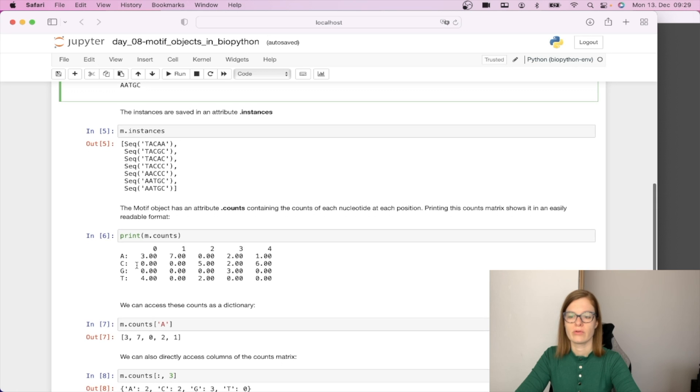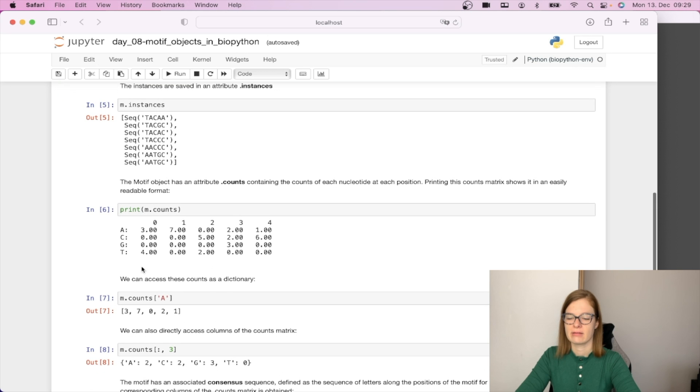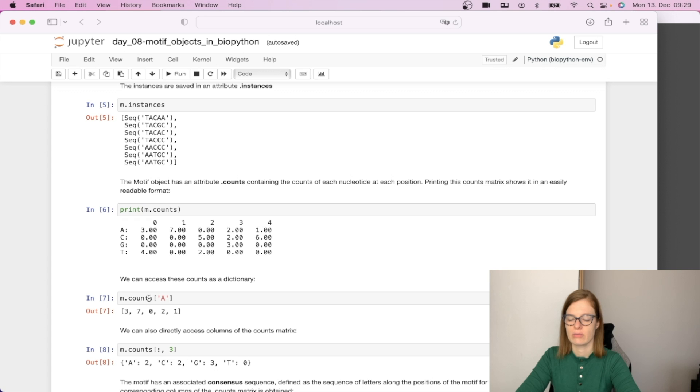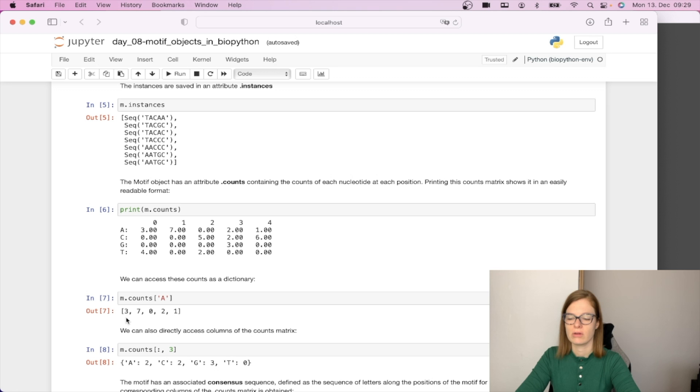Furthermore we can access these counts as a dictionary. If we would like to get all the counts per position for nucleotide A, we can call m.counts and access the A nucleotide. This will give us the list of all the counts for nucleotide A.